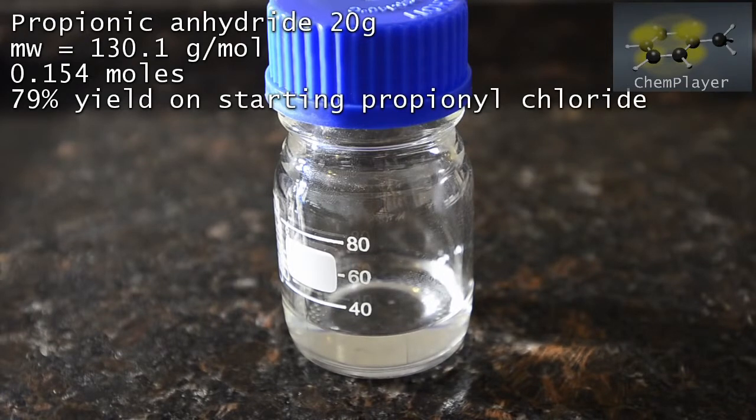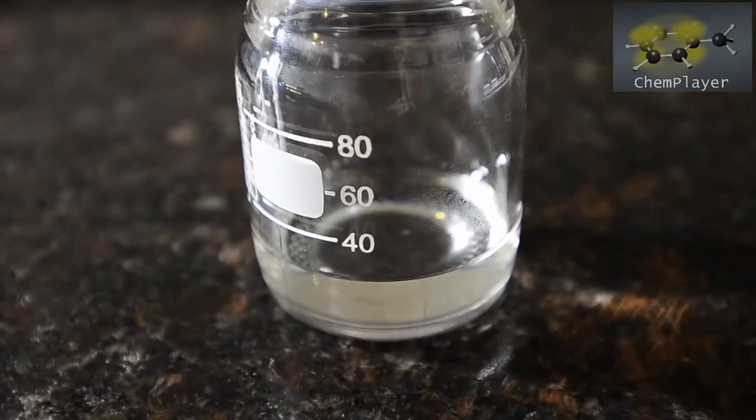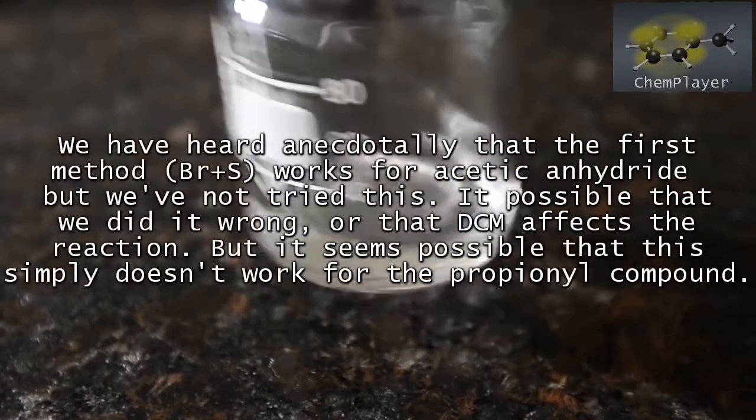This is a 79% yield on the starting propionyl chloride we used. It has a very slight sickly sweet aroma, a bit like propionic acid, but is sharp and slightly lacrimatory, a bit like acetic anhydride is. It also has a slightly fruity note to it. Well, this proves that our sodium propionate is good.